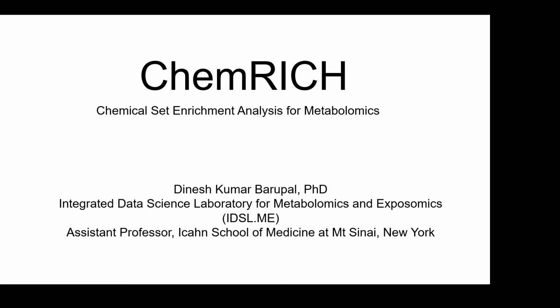So, good afternoon, good early morning, whoever, wherever you are. I want to give an introduction to ChemRICH, a chemical set enrichment analysis software for metabolomics that we developed a couple of years back with Oliver and teams at West Coast Metabolomics Center.